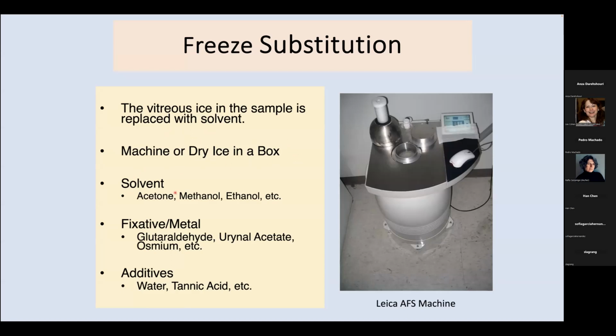For the solvent you use, acetone is usually the favorite. But there are protocols that include methanol or ethanol. You have to be a little careful with the methanol and ethanol because they can extract lipids. You could get a sample with a lot of lipid extraction if you add too much of these.